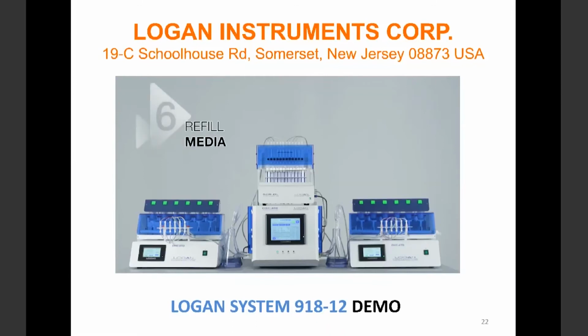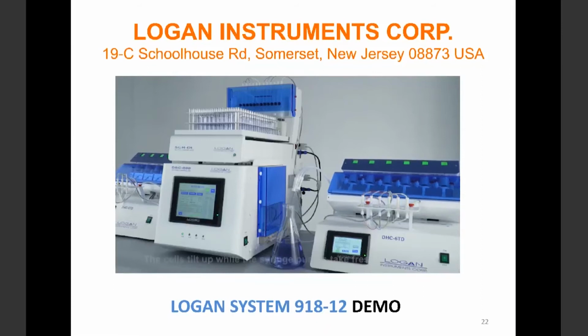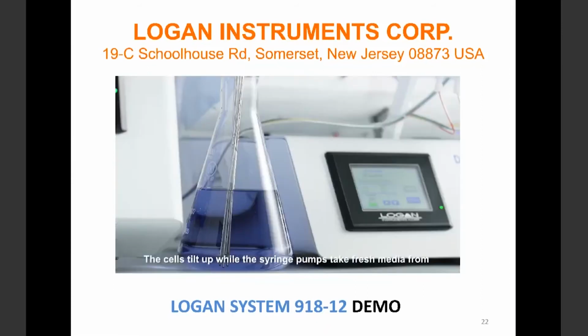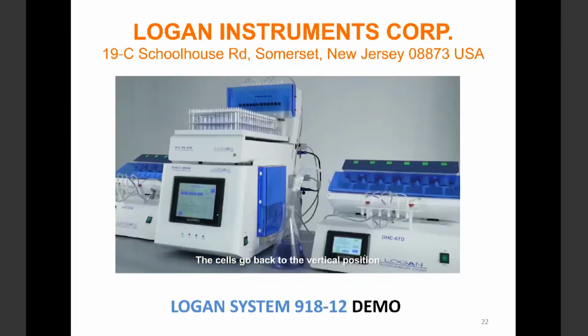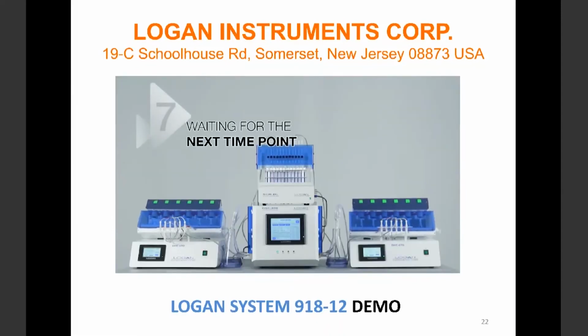Step 6. Refill media. Each time, the cells tilt up while the syringe pumps take fresh media from the media reservoir and refill the lost volume. The cells go back to the vertical position after media replacement is completed. Step 7. Waiting for the next time point.